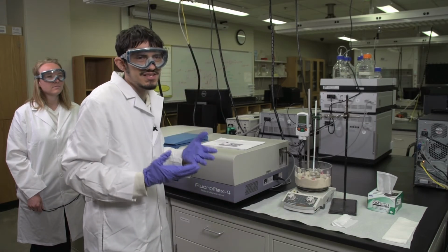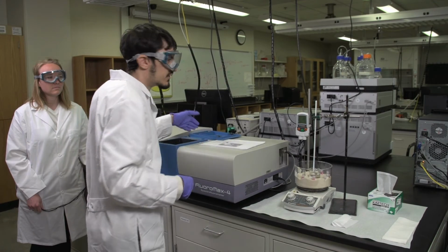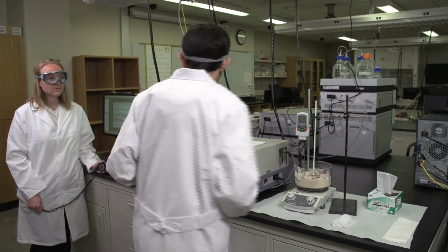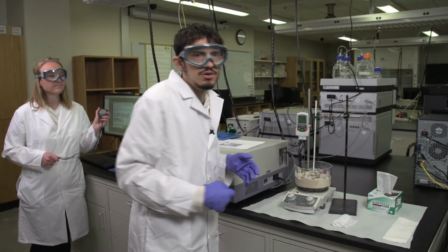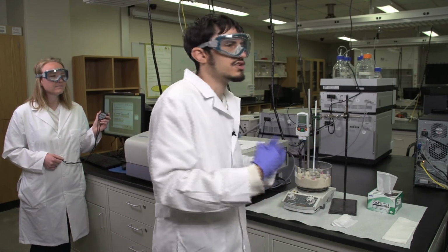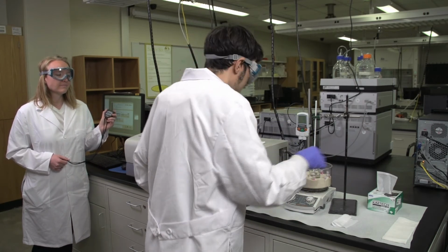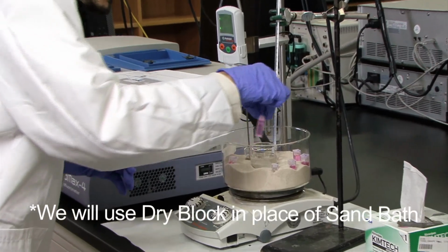The following is how to take the spectrum properly. Remove the lid to the sample compartment. Make sure that your lab partner is ready with the stopwatch, and start the stopwatch as soon as the cuvette is removed from the sand bath and being dipped into the water. So, ready? Go ahead.